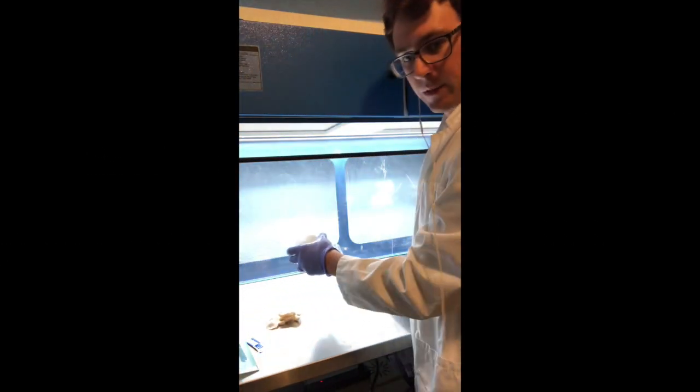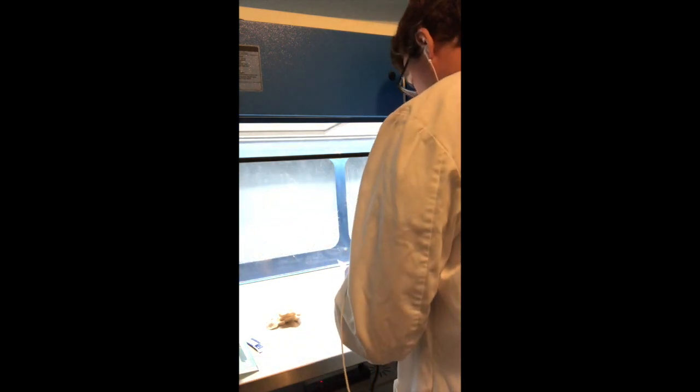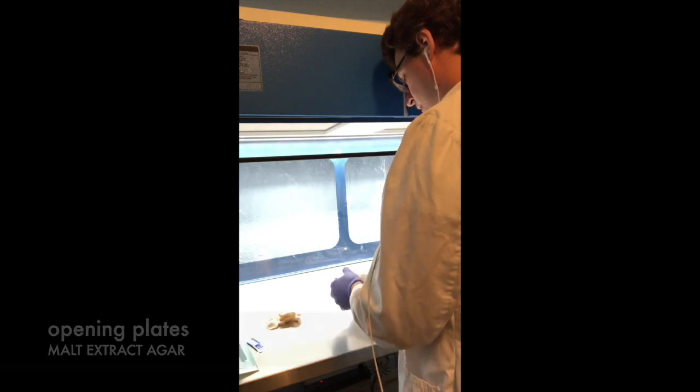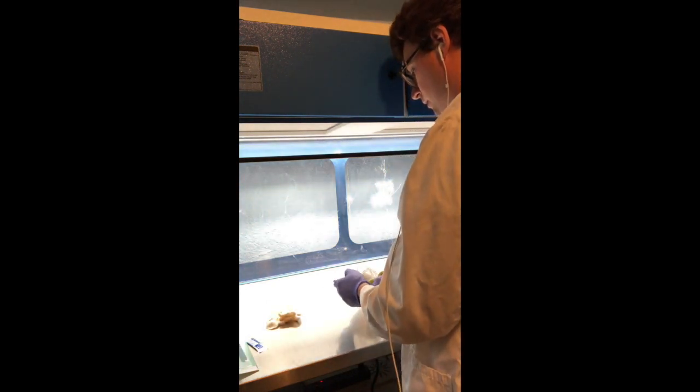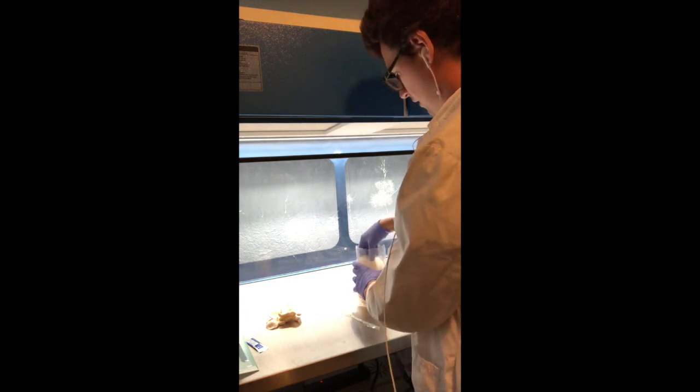Now I'm going to start by opening up this pack of blades. I like to use malt extract agar on my culture — it's just a good go-to medium.